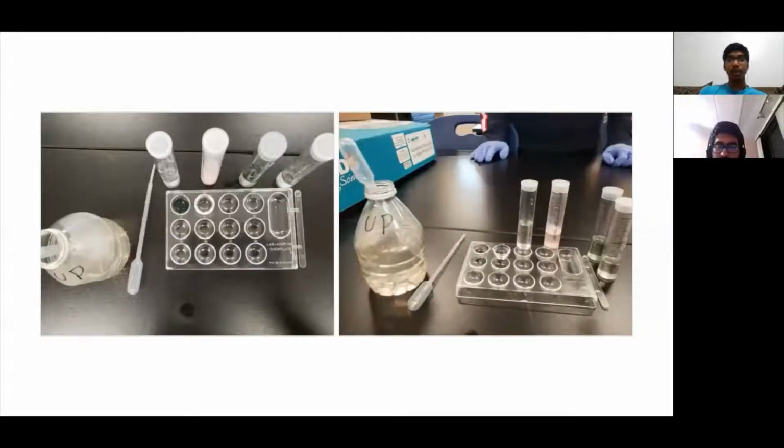So here are the test results from upstream. In the upstream water sample, we found that the color was a greenish color, which meant that the pH was around 8.